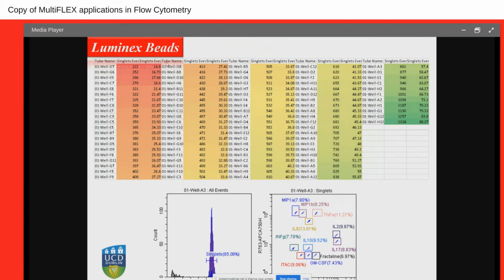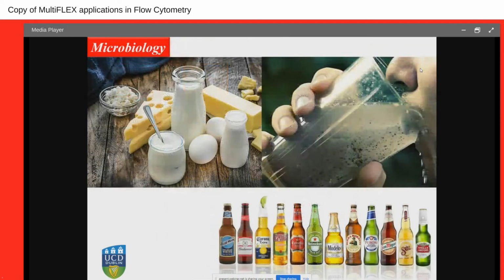And we can see our kits were quite inconsistent in terms of the numbers, and it was not just one plate, it was several plates. With this information, we could come back to the company.